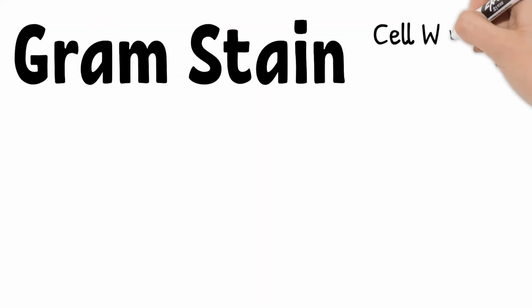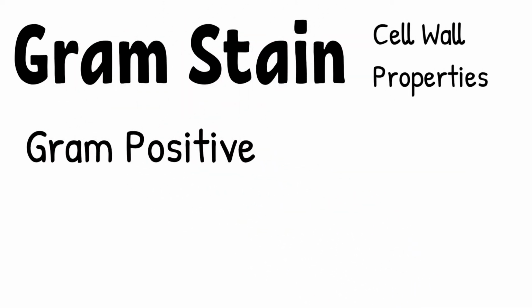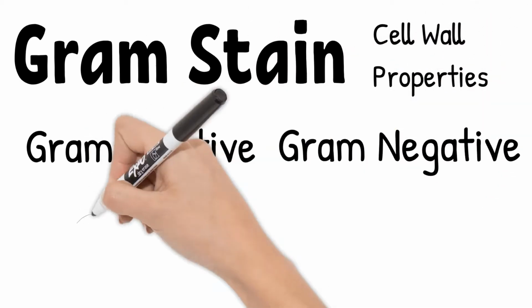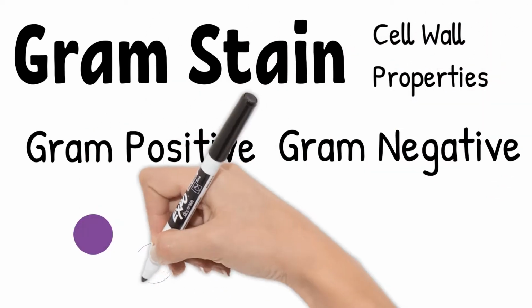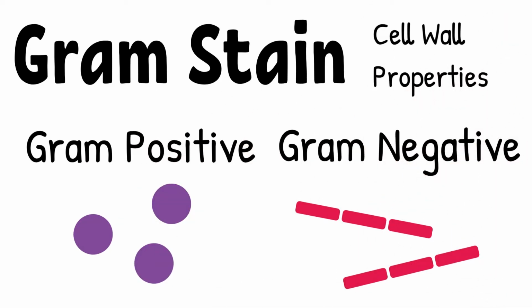Let me give you a quick overview of gram stain. Gram stain works by playing with bacterial cell wall properties. The differences in cell wall properties of gram-positive and gram-negative bacteria lead to different colors post-staining. Gram stain differentiates bacteria into two main groups, gram-positive and gram-negative bacteria.